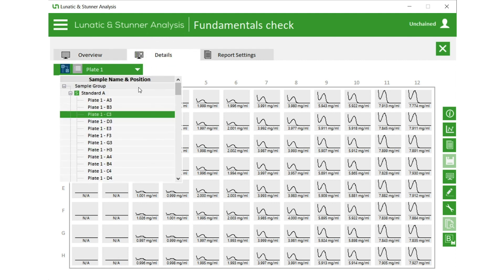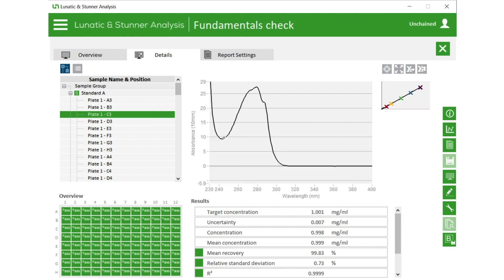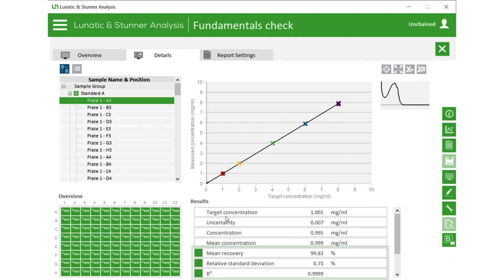Click the Details tab to review each individual well, or check out all the spectra together across the concentration range of the Fundamentals. See the performance of all samples graphed at once, and check out the metrics showing off the accuracy, precision, and linearity.